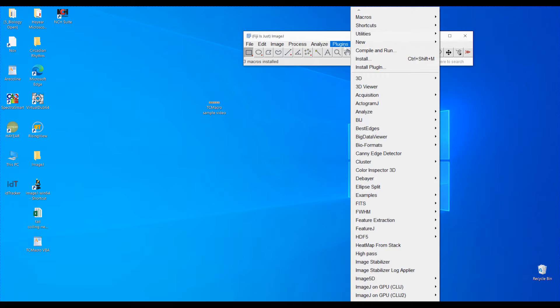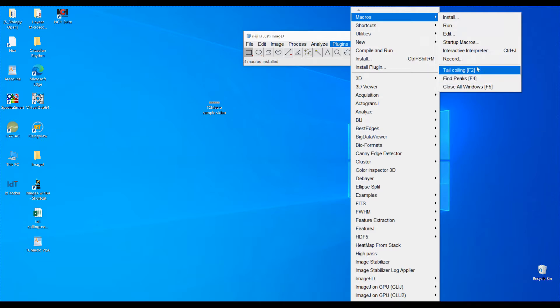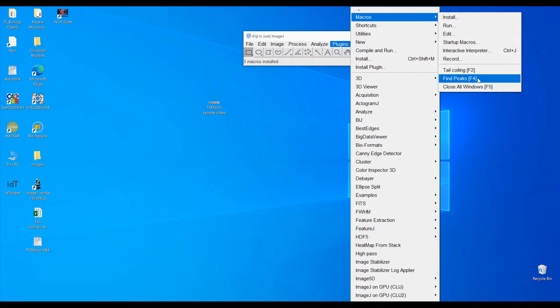The three macros are: Tail Coiling, Find Pics, and Close All Windows. Tail Coiling contains all the macros we need to obtain all the data. Find Pics will do the find pics using the BAR plugin, but this is only used if you want to do manual editing or some fine adjustments, or if you haven't done this process before. Close All Windows is used because we will have lots of windows open after we finish the process.